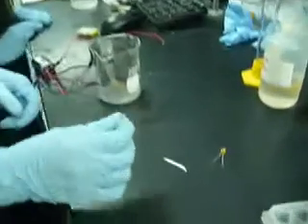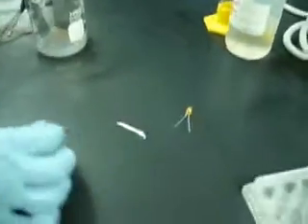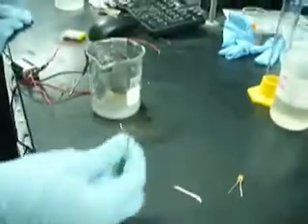But there are 3 LEDs. Which one should we use? We can use whatever color we like. If you attach it to the electrodes right here, it'll turn on. Oh my gosh, that is so cool. It's green. I know. Wait, why are there different colors in the first place?